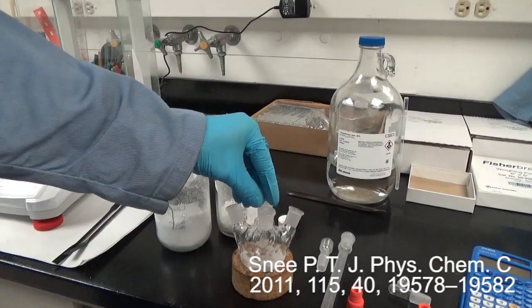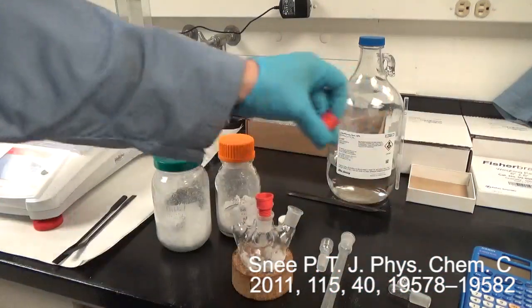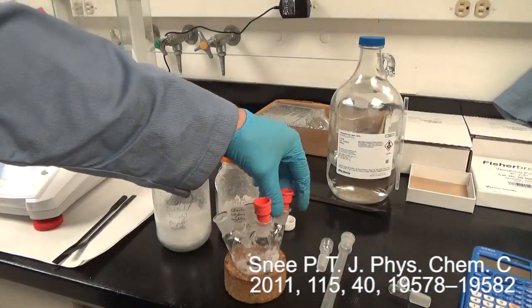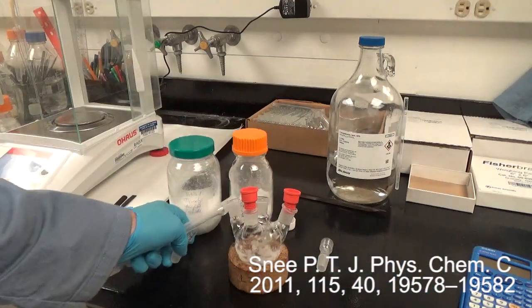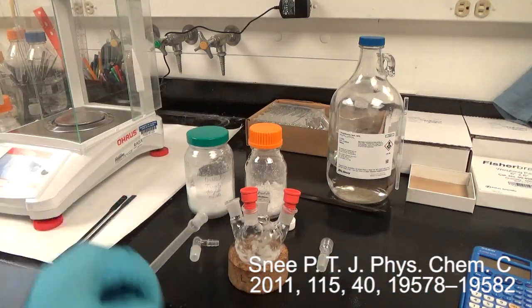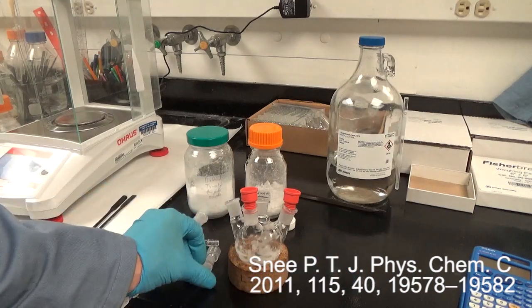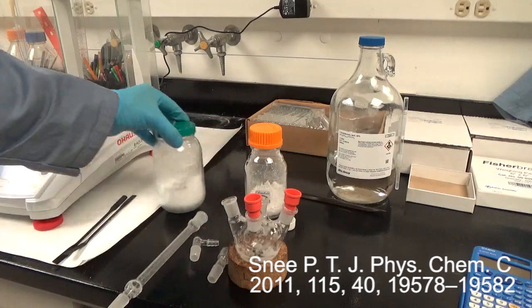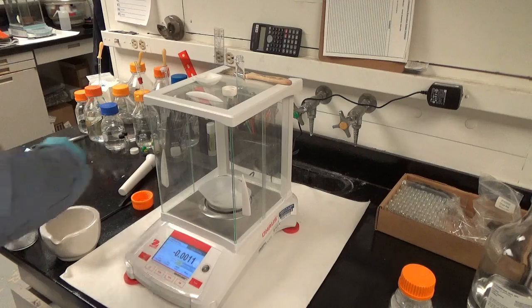Okay everyone, today we are going to overcoat cadmium selenide quantum dots in this four-neck round bottom flask. We have four ports: two for injecting precursors with septa, one for our nitrogen-vacuum connection, and one for the thermocouple temperature connection. Here are the chemicals we're going to use: TOPO, tetradecylphosphonic acid.